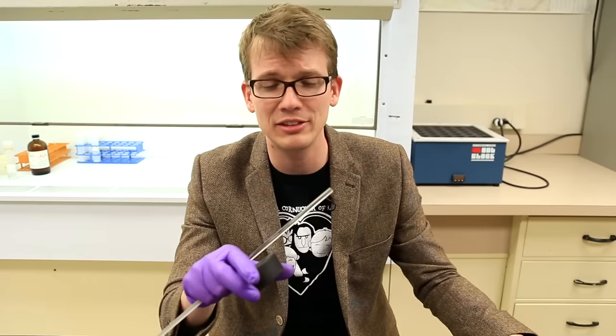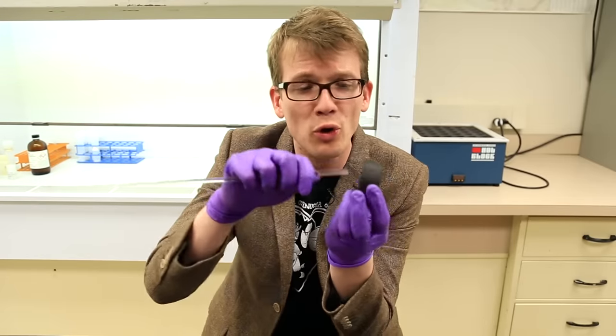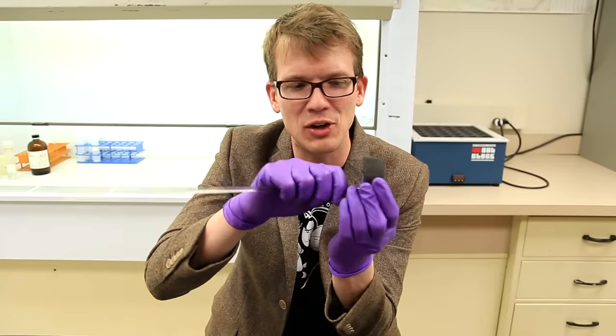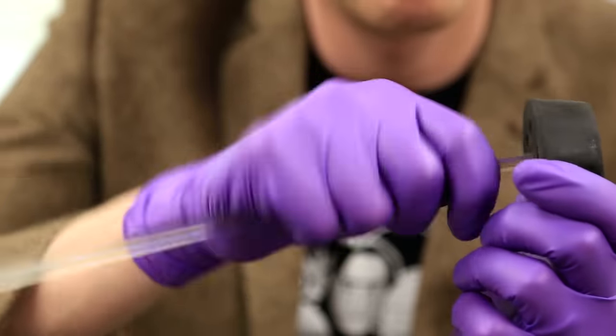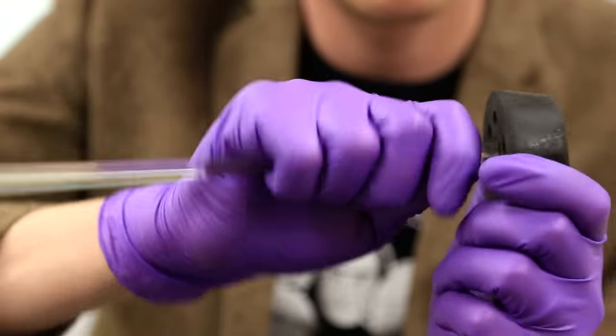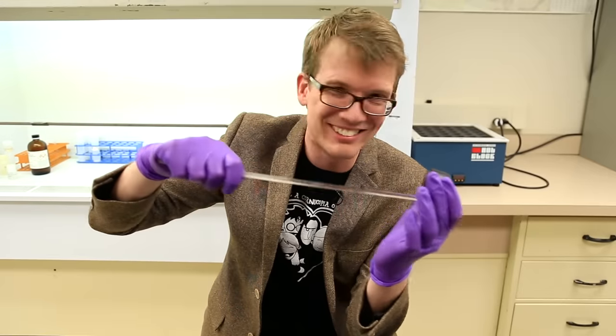So when you're doing this, and it is sometimes necessary, you can use a bit of water or a lubricant or some kind of Vaseline to make it easier to go through, and then you hold it close and make sure your hand is not on the other side. So, very close, and make it go through like that. Not like this, because that's, no.